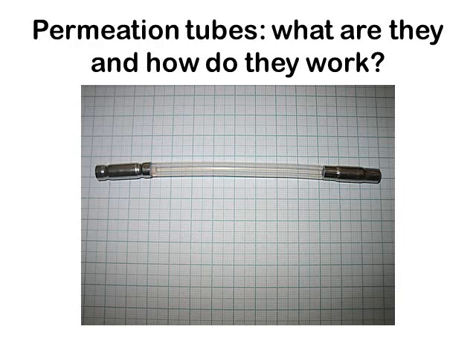As such tubes are usually not refillable devices, once the VOC or SVOC filling has been exhausted, that tube is not reusable. The cost of calibration and safe filling of commercially available tubes can be considerable. Also, the number of commercially available types of tubes and of compounds is limited. But there is now an alternative and much more flexible way of making such standards without such expense or other limitations.